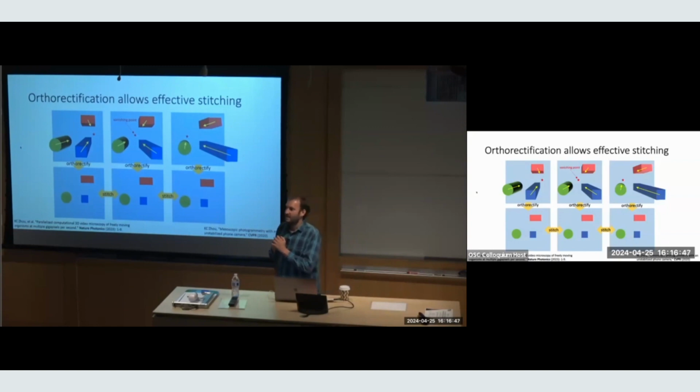Each object from the side walls. Yeah, so the lighting effects, we're assuming a diffuse scene in this case, and the illumination's diffusely coming from above. We have an array of LEDs that we illuminate with. Yeah. What about the occluded area? Yeah, occluded areas are tough. Can't help you. We're not getting like a full 3D volume in this case. We're just getting a surface height.